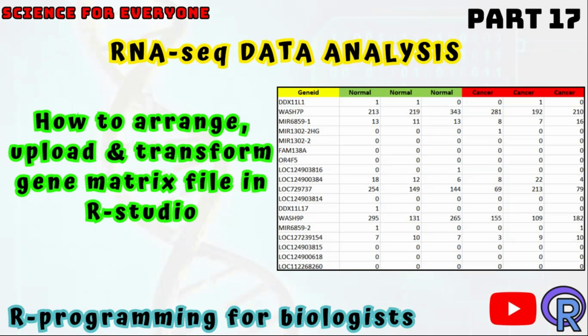In part 18 of this video series, I will show you how to visualize your data, and after that I will also explain how to perform differentially expressed gene analysis. It will be the last part or the second last part of this video series. So stay tuned and you will learn a lot.